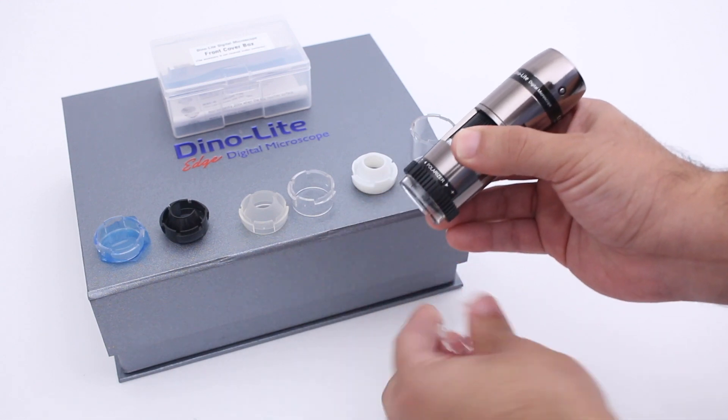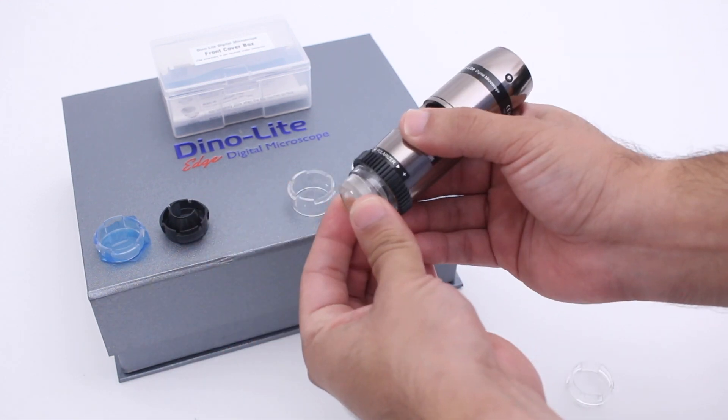The interchangeable caps have a number of uses including adjusting lighting and standoff length.